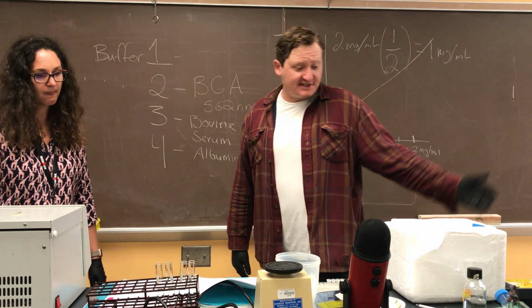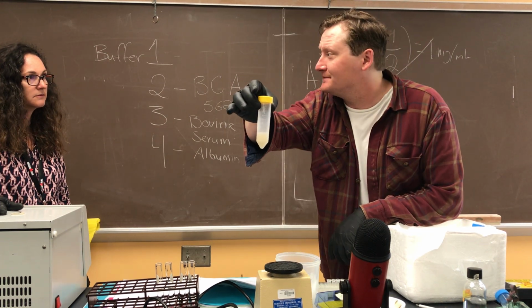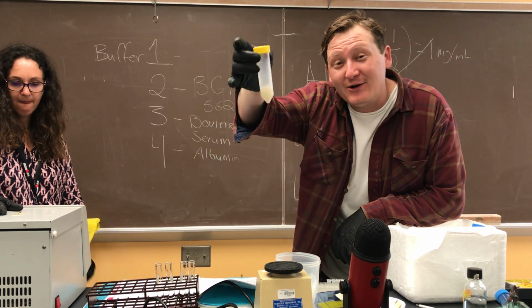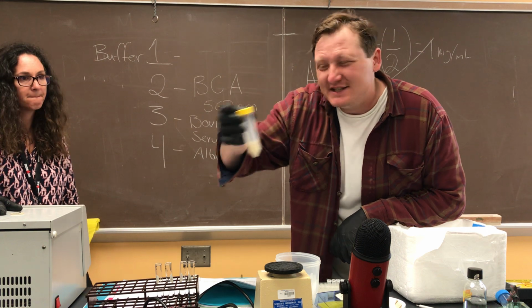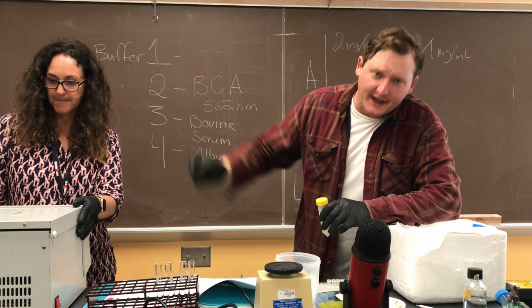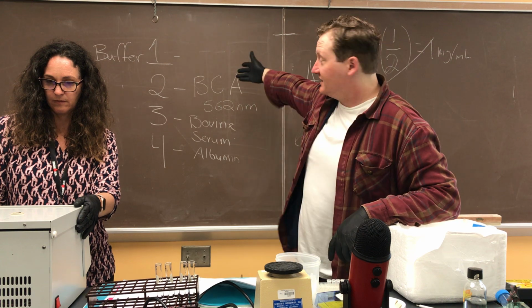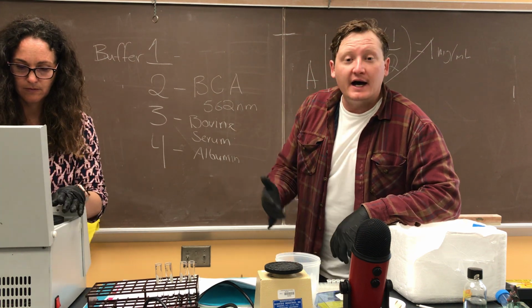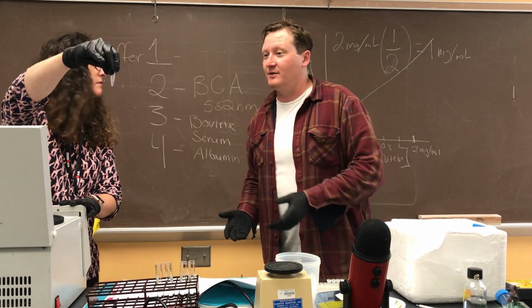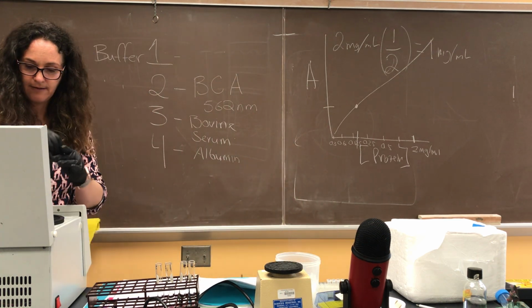So, just to say it one more time, we've got our original sample here, which is our E. coli culture. Sorry for yelling at you, I want to make sure you can hear me over the centrifuge. Now the E. coli cells are kind of dispersed through there. So what we're doing here is getting all the cells concentrated into one little region. We're going to dump off the fluid that these are swimming in right now. We're going to put in all these buffers that we've been talking about, and then mix that up again with the pellet, and that will allow the buffer to interact in a concentrated way with the cells. I'll go ahead and put one right in front of the camera so we can see what a pellet looks like.